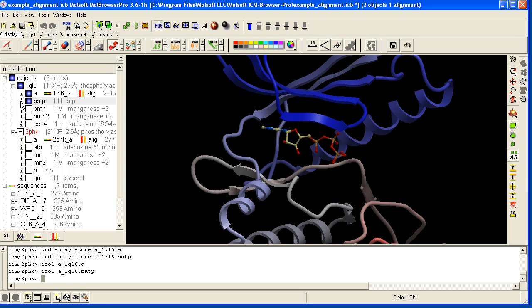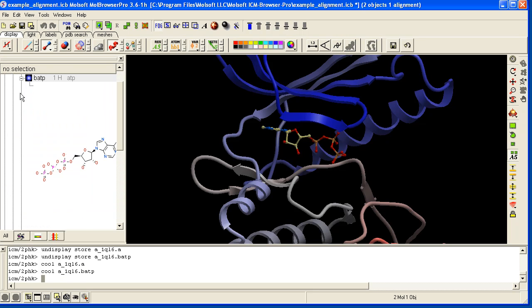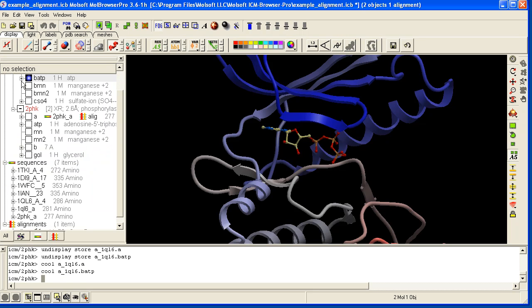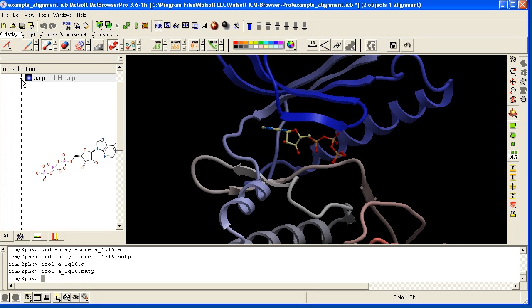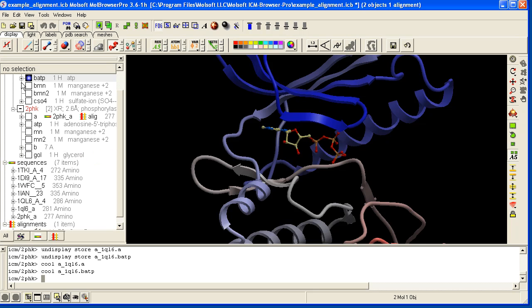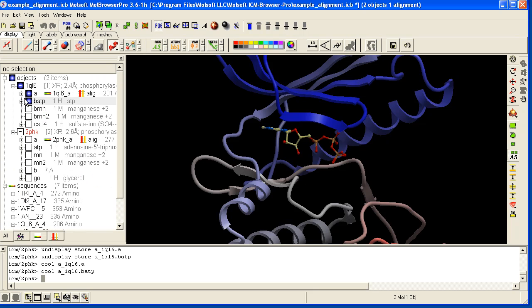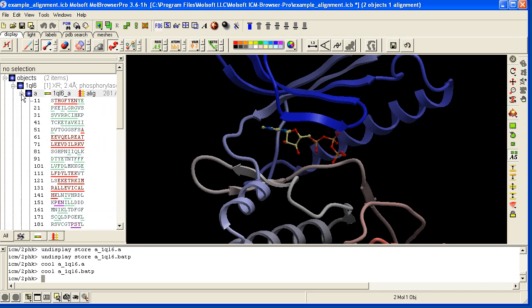You can see more information regarding the molecule by clicking on the plus sign. Or if we do it on the A subunit you'll see the sequence.